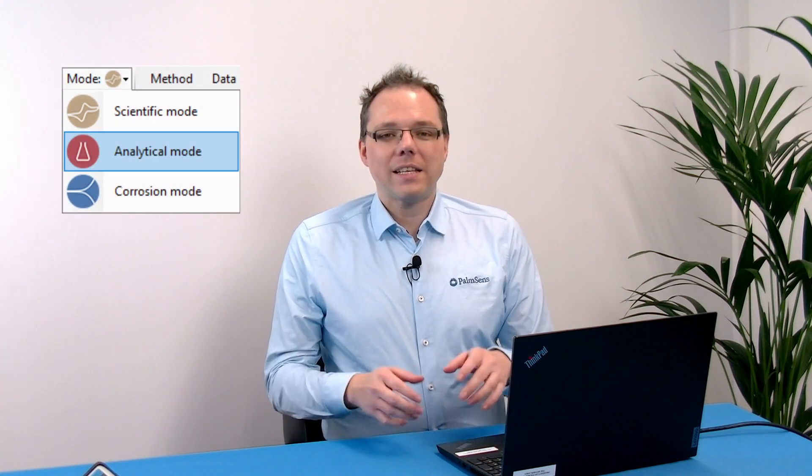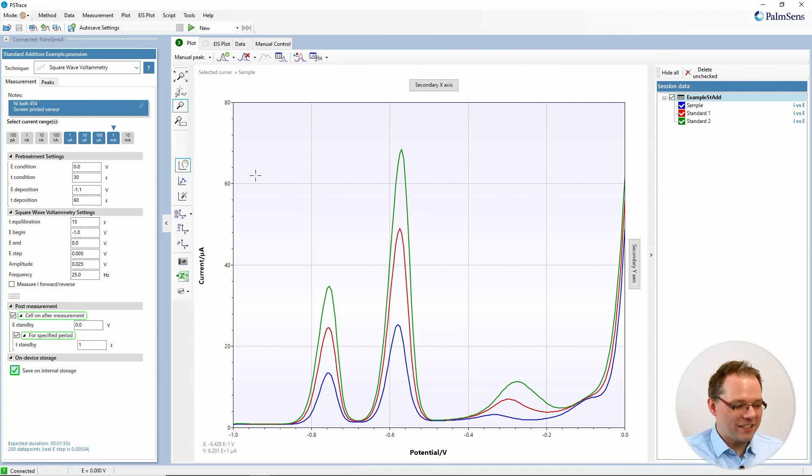Hello and welcome to this PSTrace tutorial video. Today I would like to talk about the analytical mode, which is a mode of PSTrace that allows you to calculate the results from a standard addition method or by using calibration curves in an automated way, so that you can easily get to your results without all these small calculations where you can easily make a mistake. Let's have a look at PSTrace to find out how to do this.